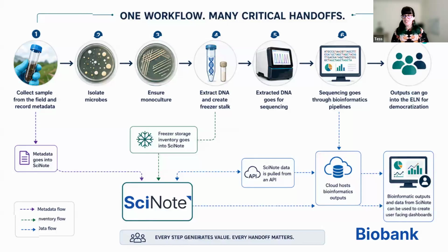So I have one more little anecdote for everybody, and this is on biobanking. As a microbiologist, biobanking is really important. It's the way that we organize data for our microbes. So we might be collecting certain microbes in order to understand their function for a specific use case that we have. And this is one workflow with many critical handoffs.